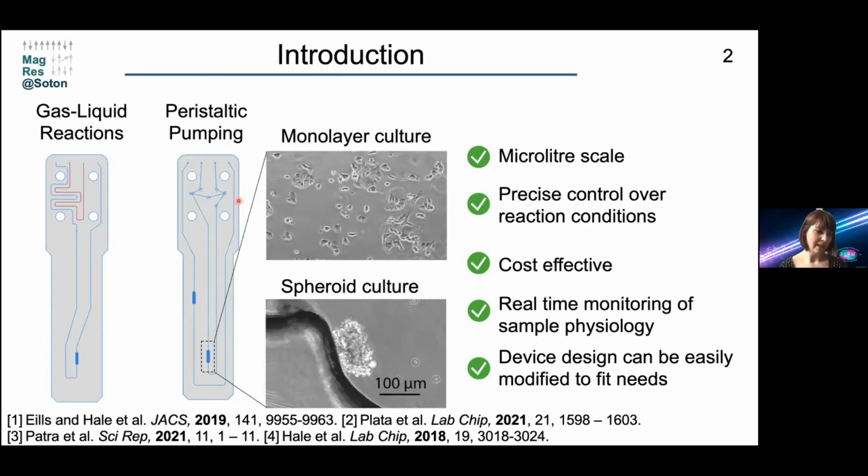Implementing hyperpolarization of metabolites will allow us to access metabolic pathways which are otherwise unobservable due to limited sensitivity.